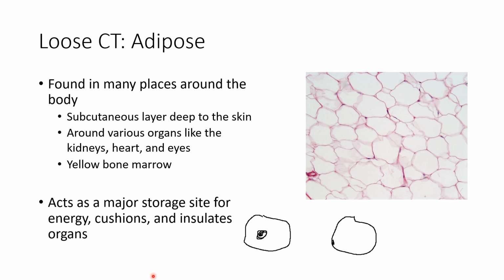This can be a difficult tissue for beginner histologists because it's sometimes hard to focus. All that's getting stained here is the cell membrane, and without the big nucleus in the center, it can be hard for us to really focus it under the microscope. So if you're having difficulty seeing this tissue under the microscope, make sure you turn your light down just a little bit or play with the iris diaphragm so you can get a better contrast to see the tissue. It kind of looks like chain link, or not chain link, chicken wire. That's what I was looking for.